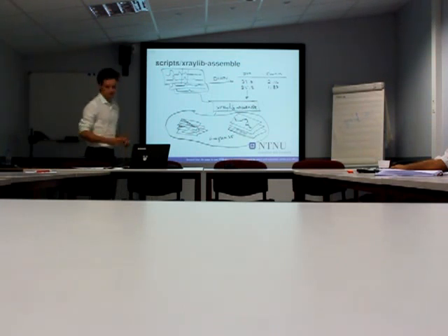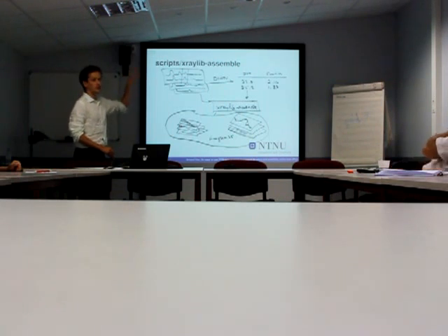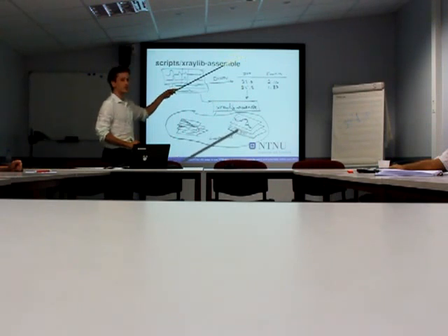So an advantage of doing this peak fitting is it's pretty robust. You don't have to do a lot of corrections on the data itself, like air scattering, since you fit it to a linear background, and you only use, for instance, the area of the Gaussian peak. And since it's really nice, you will output the fitted peaks and the data it used, so you can inspect and see that it's doing a good job.